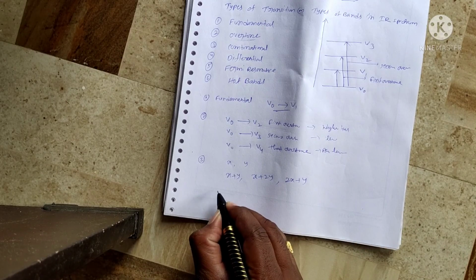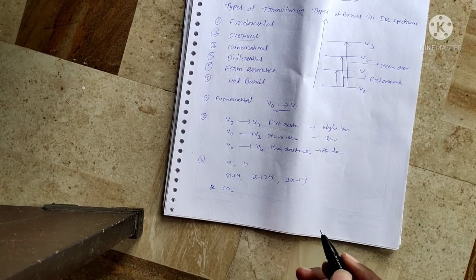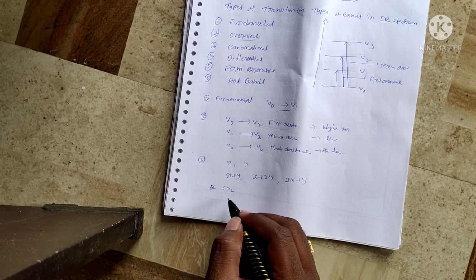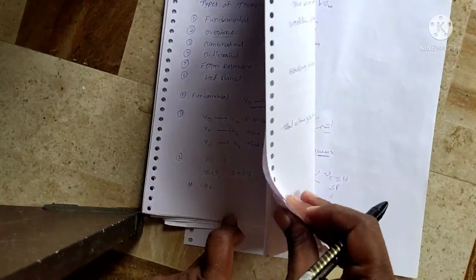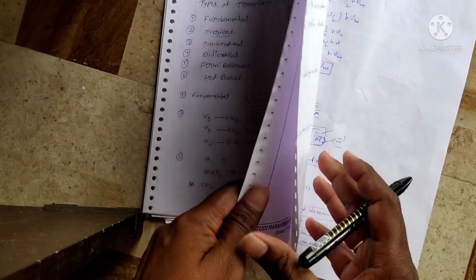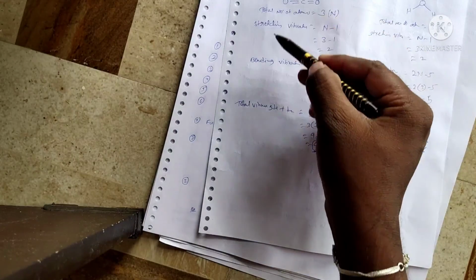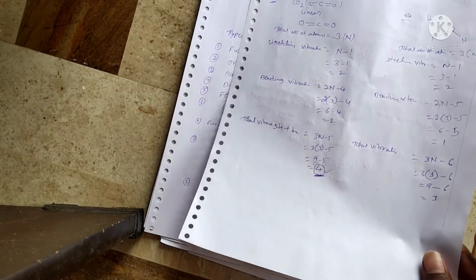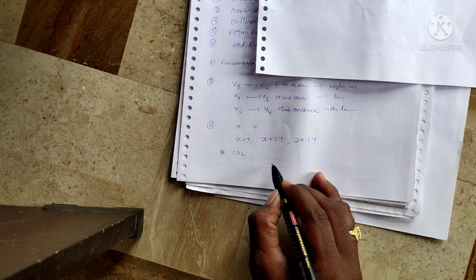For example, we take the carbon dioxide molecule. It is a linear molecule. How many vibrations are possible here? We already discussed that there are a total of 4 vibrations in the CO2 molecule, so we get 4 bands.